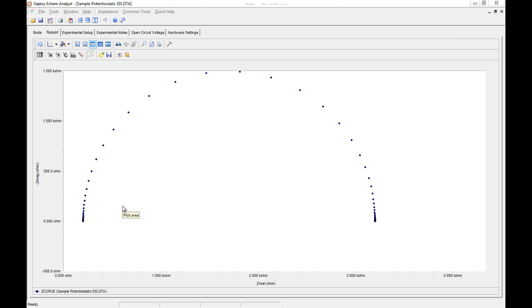What I've done is loaded up the sample Potentiostatic EIS data file from the MyGamriData folder, and we're looking at the Nyquist plot of the Randall cell that comes included on every universal dummy cell.